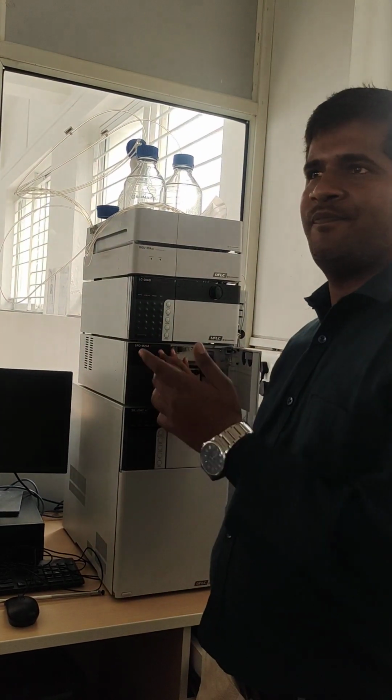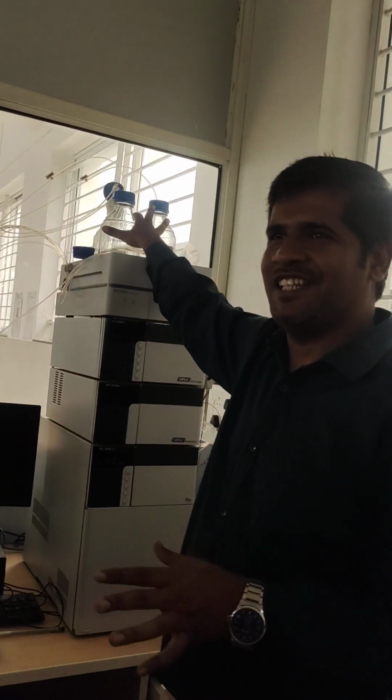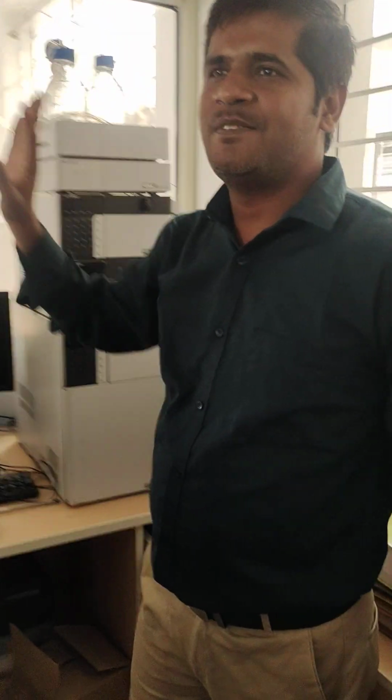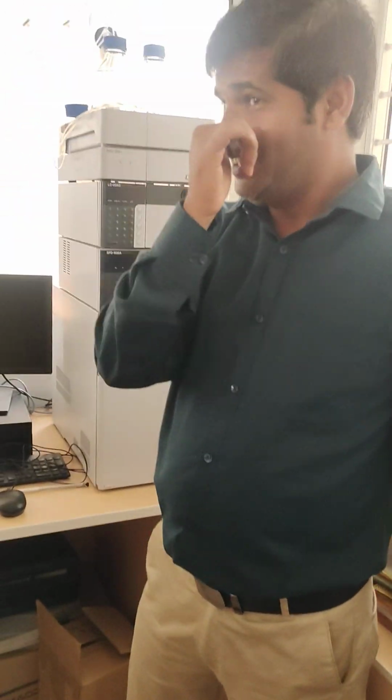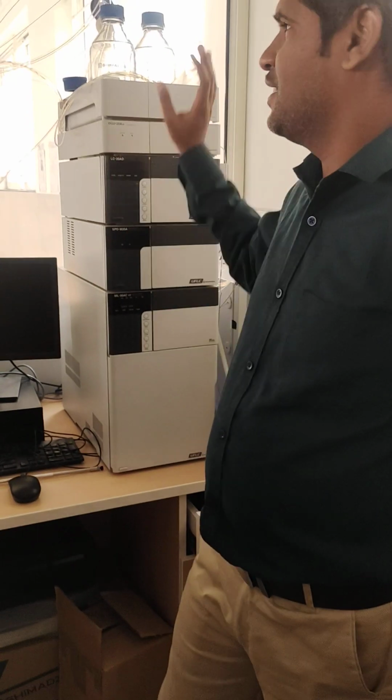Understood? The use of gradient elution and isocratic elution. Now which system do we have? Gradient. Means 4 ports are available. Now bottles are only 3, but ports, just check it, 4 ports are there. One bottle has been broken during the transportation. I have told the company to send me 1 bottle from your department, and we will analyze at least 4 mobile phases there. Now we are using the can for the D port, just for the understanding purpose. They will send it there.